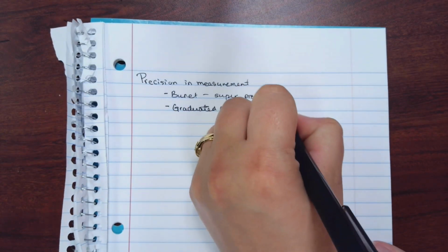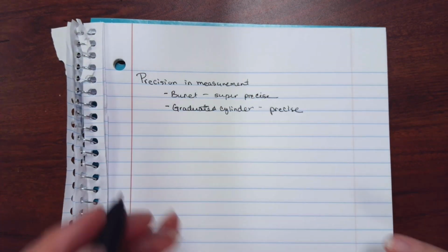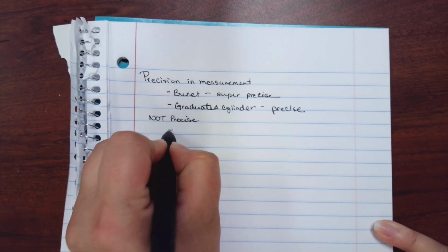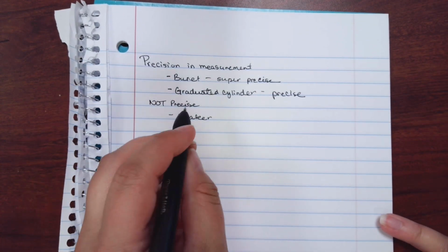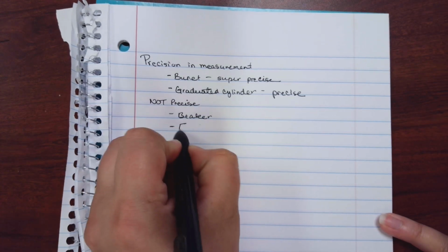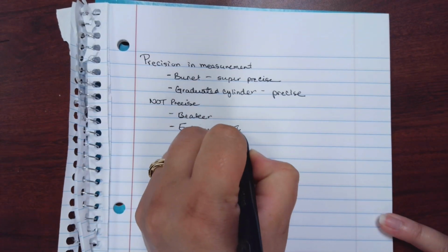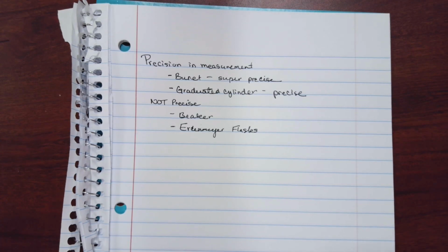That is precise. Things we would never use to measure would be things like beakers. Beakers are really only for holding stuff. They have lines on them so you can kind of estimate how much liquid you have in a beaker, but really beakers are designed for holding and not measuring because they're not very precise. Erlenmeyer flasks, again, have lines on them, but not very many, and so it's more of an estimate of your volume. So really not great.